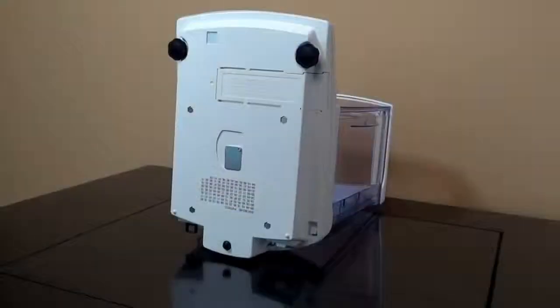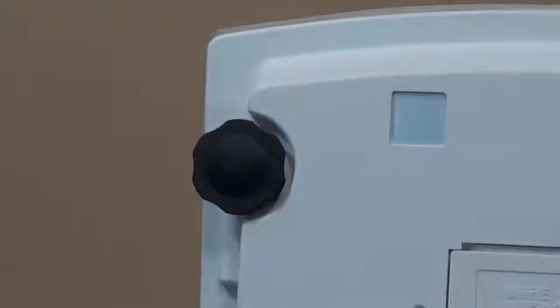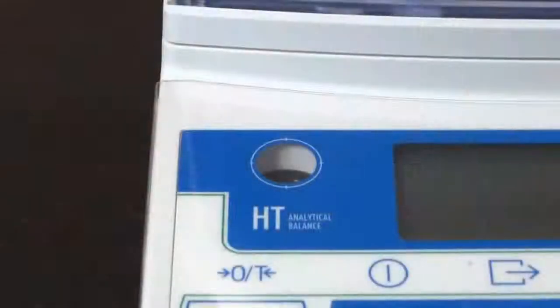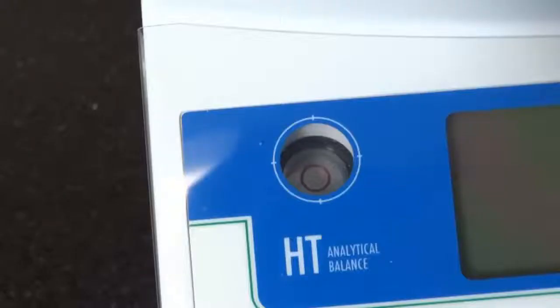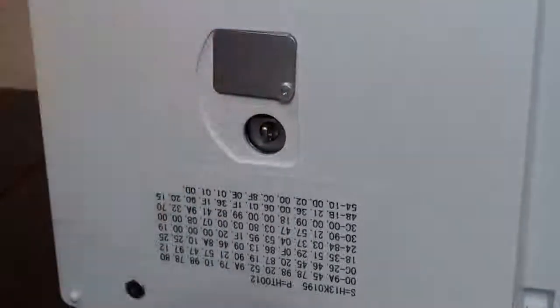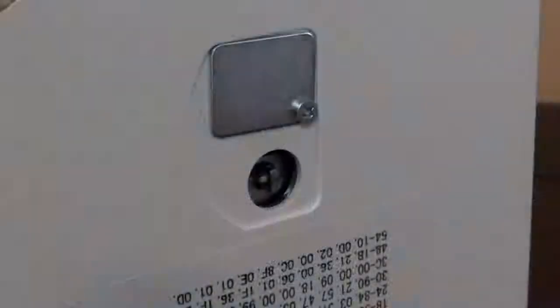Starting from the bottom of the balance, the HT has three support points, two of which are adjustable. There is a spirit level next to the display to help with leveling. Under-balance weighing can be enabled by rotating the metal plate in the base to reveal a hook used for suspending samples.